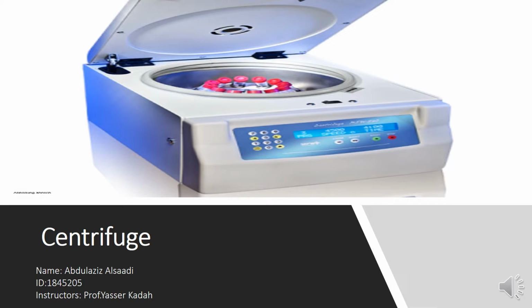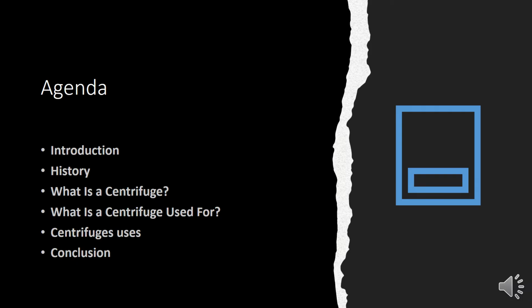Today I will talk about the centrifuge device. Agenda. First, I will talk about the introduction, then the history, then what is a centrifuge, what is the centrifuge used for, centrifuge uses, then the conclusion.